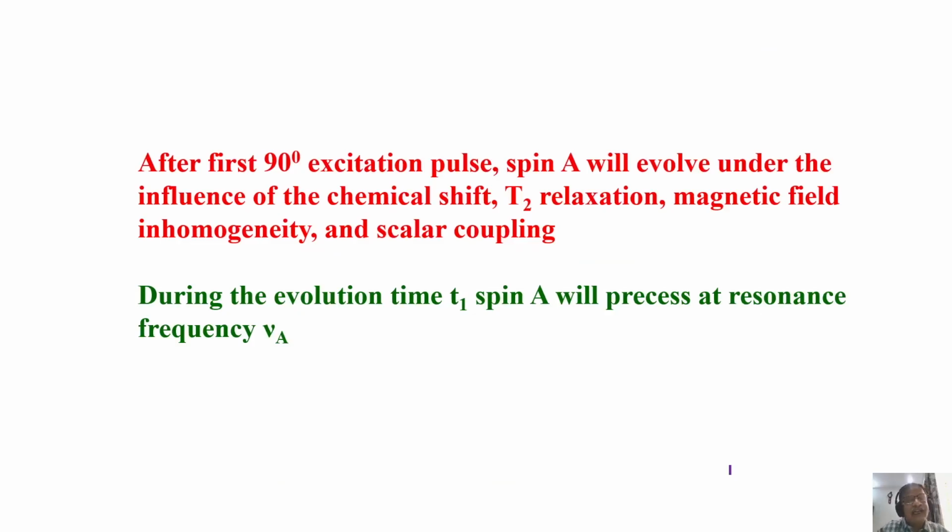So now let us take the example of 2 spins which are coupled. How do we get the peaks? Okay, this is what happens. But how does one spin have a correlation to the other spin? This gives you correlation information. What is correlating and how does it do so? I give you a hand waving argument here. There is detailed mathematics to understand this, and you have to go deeper into that to completely get what is happening.